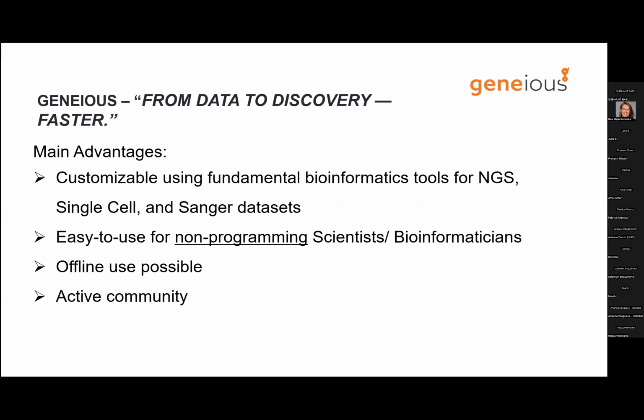And very important, it's a bioinformatic tool, but it's made for non-programming scientists. You don't have to write code. You really just have to click and collect. This is really nice for veterinarians like us, for example, who are not trained bioinformaticians, who don't have to write code, and you still want to get your customized data analysis workflows.